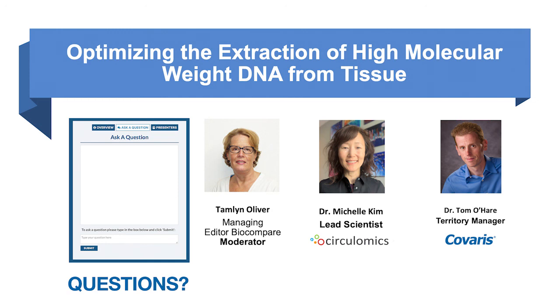Okay. Any development of enrichment method of bacterial DNA from host human background for ONT or PacBio sequencers? Let's see. I know that people do this computationally after sequencing, but if you're asking whether we have a way to separate bacterial cells from host human cells, we don't have a process for that at the moment.